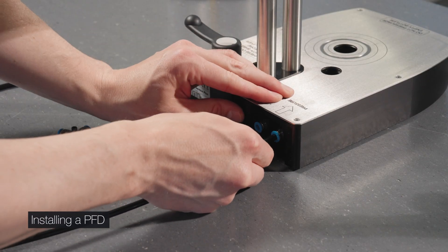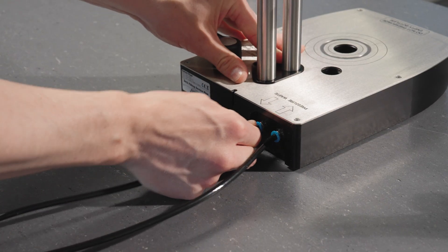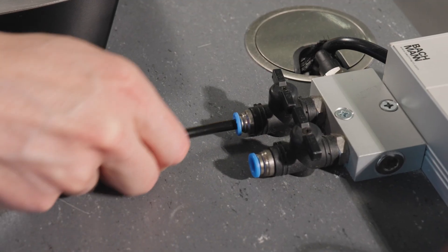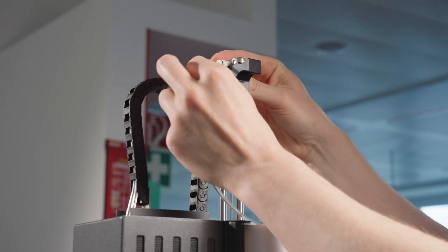To install the PFD, first connect the black hoses for gas supply and the transparent hoses with a filter for sample transfer.